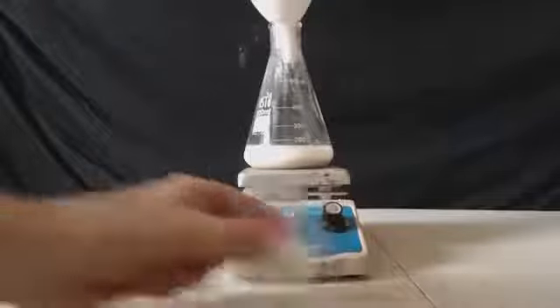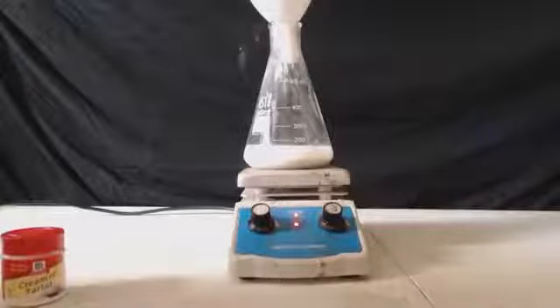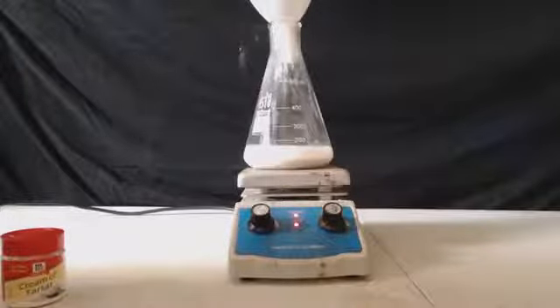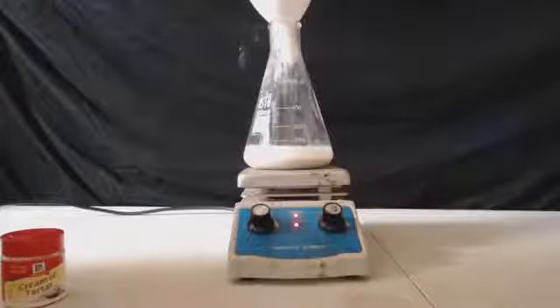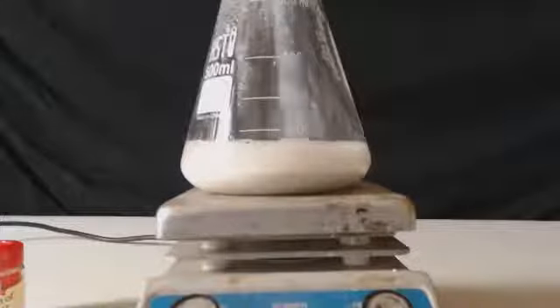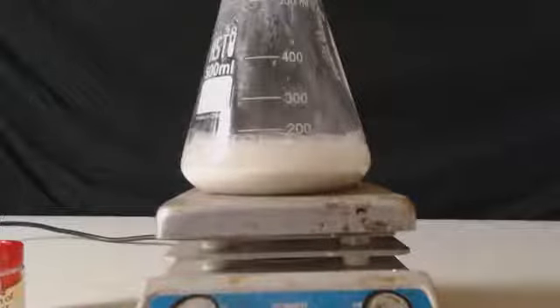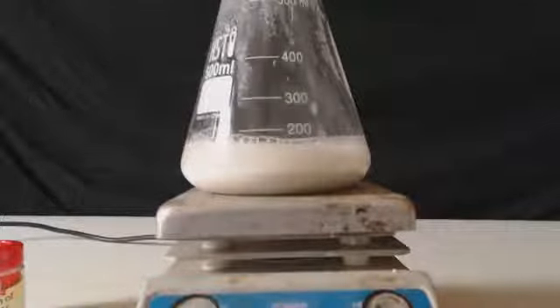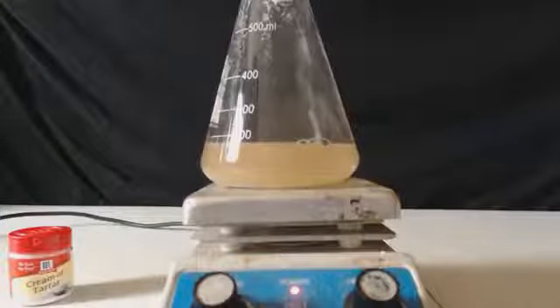Just like when you put baking soda and vinegar, this is going to make some carbon dioxide and it'll bubble. So you just want to add a little bit at a time. I'm going to put a little spoonful. You can see the effervescence. I got most of the sodium carbonate in there. I just dumped a bunch in.